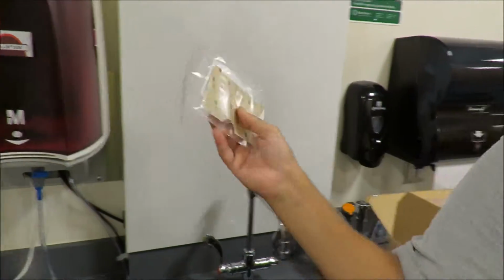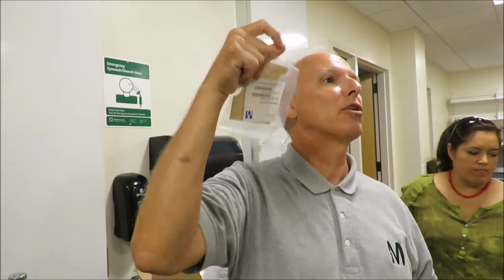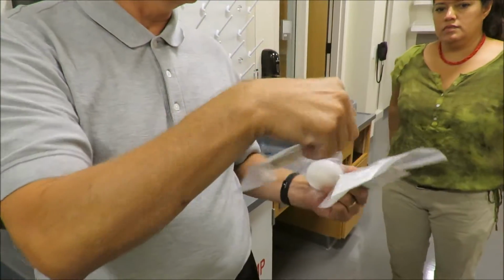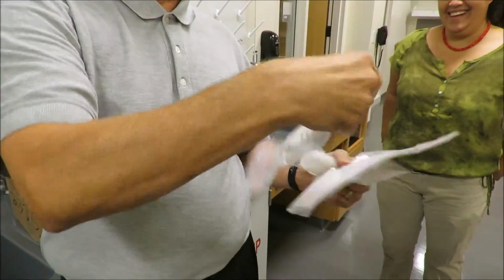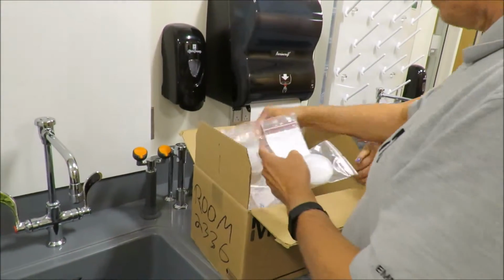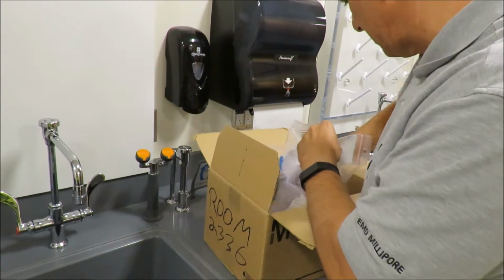That's an easy way for you anytime you have to have service. You don't have to look up the serial number. You can just pull the card, and you have a history of when the system was serviced. So that should probably be applied to each unit. They can fill out the information and stick those on there. I can do it if you want me to. Well, that'd be up to the end user. They may want to put it elsewhere. Trying to see what else you guys have in here.